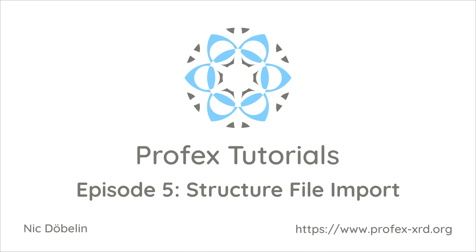Hi and welcome to Profex tutorials. Even though Profex includes more than 800 structure files, it does not always contain all the ones we need. In this episode I'm going to show how we can download files from crystal structure databases and how they can be converted to the BGMN structure file format.